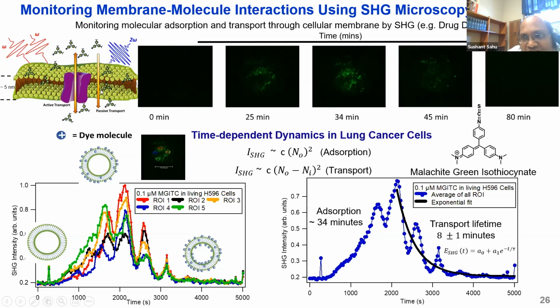Okay, so there is a net cancellation of dipoles, or you can say that it destructively interferes, and as I mentioned, that leads to the signal drop in SHG. Okay, they get exactly oriented in the opposite direction, as you can see in this cartoon illustration, where the positive charge represents this malachite green dye.